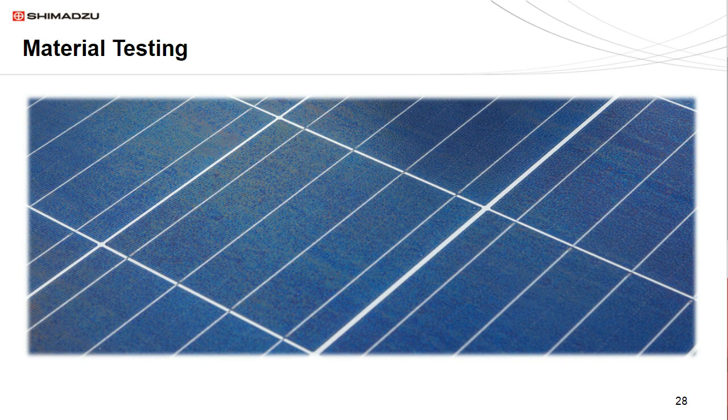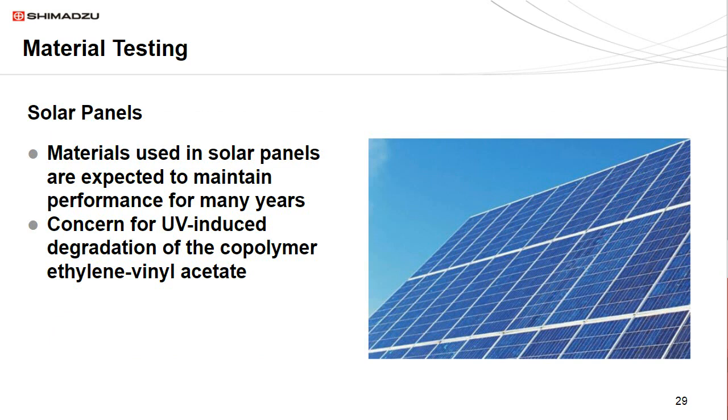In our final market of the day, we break down our material testing market and how PY-GCMS fits into this market. Now, material testing is extremely vague and can cover a large range of materials, but what we're actually going to focus on is quite a unique application and offers an even more unique PY-GCMS configuration. If you were thinking solar panels from the previous slide, then you were absolutely correct. And that's exactly what we're going to talk about in our final application of the day.